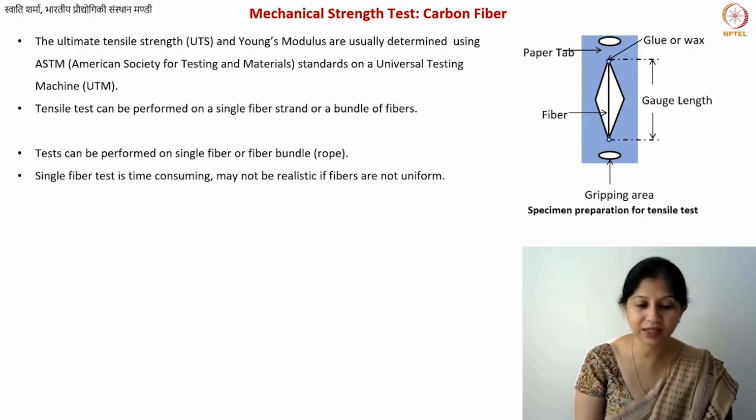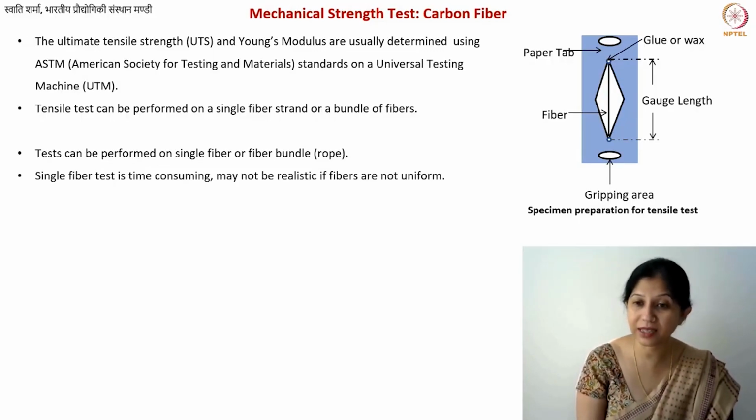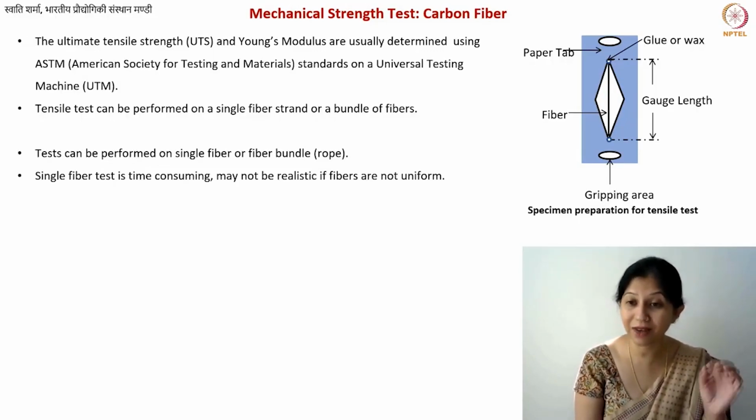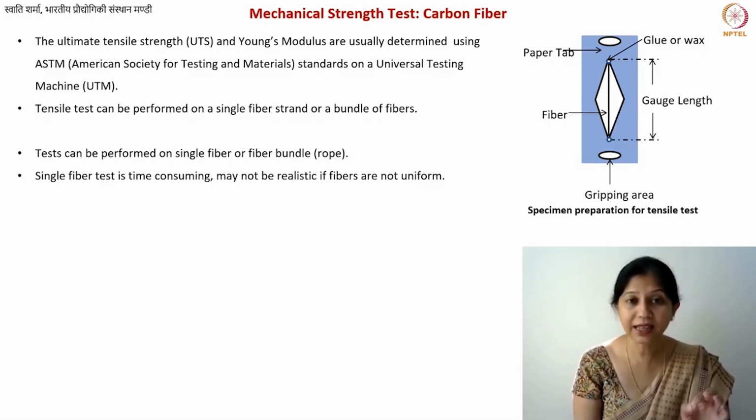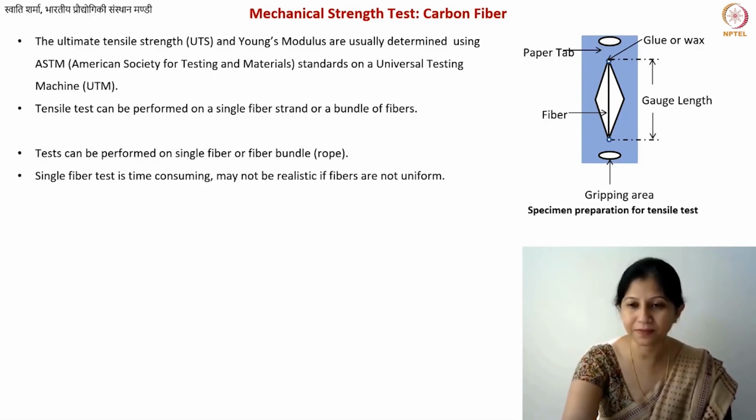Nowadays there are so many image processing software available. Many of them are also free. They give you the information about the average diameter of fibers in your sample. So if you want to test a single fiber, then you should take the one that falls in this average diameter range. Other than that, in general, if you want to utilize single fibers for a certain application, definitely you can perform the test on a single fiber. However, you need to know how realistic it is in terms of your application.